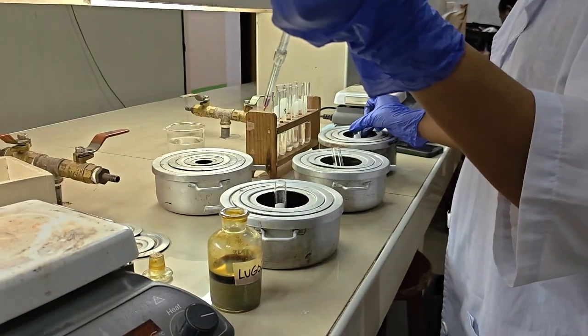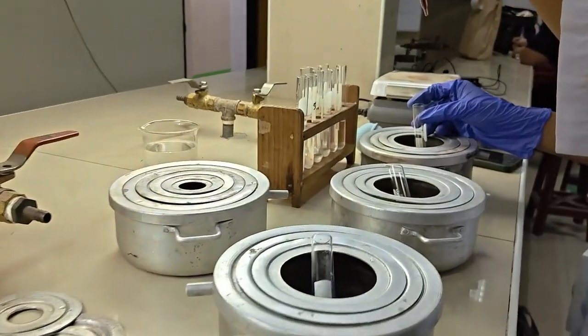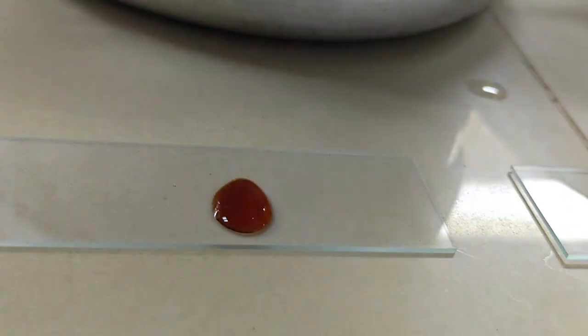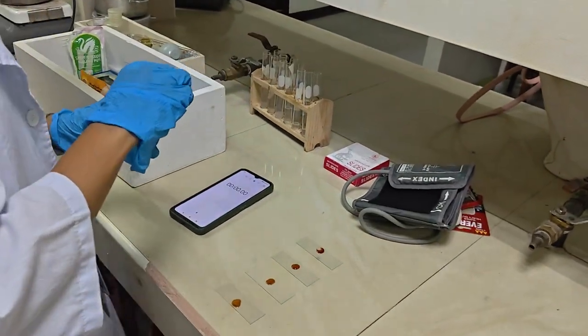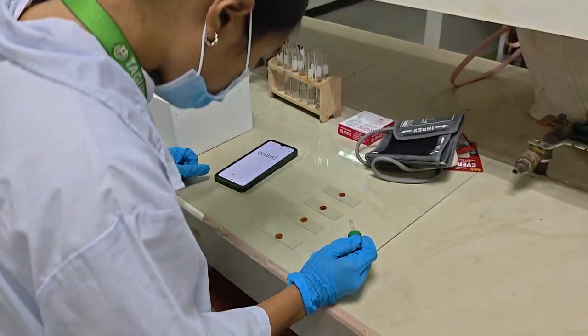Since enzymes are sensitive to environmental conditions, their activity can change depending on temperature, pH, and substrate concentration. In this experiment, iodine solution is used to determine if starch is still present. A blue-black color indicates that starch is present, while the absence of the blue-black color means the starch has already been digested by salivary amylase.